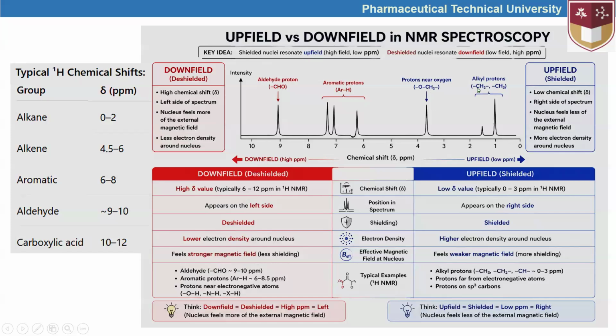Okay, therefore, the signals that give the resonance, the signals that belong to methyl groups, result from a smaller radio frequency, not a bigger radio frequency.